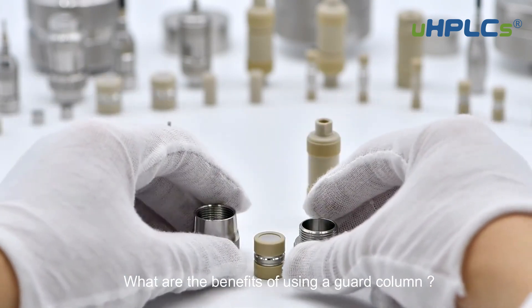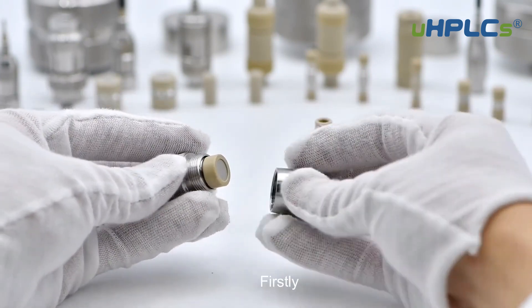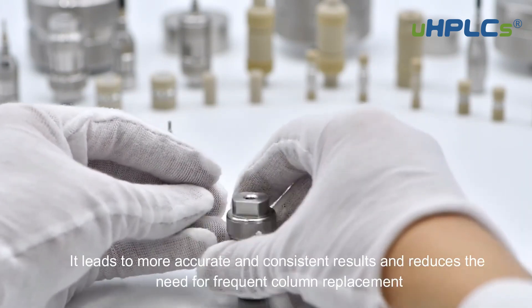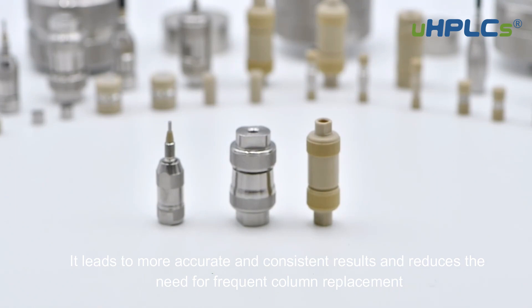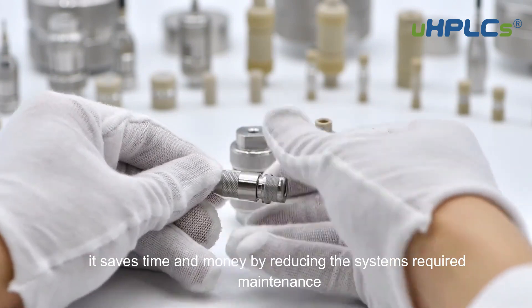What are the benefits of using a guard column? There are several benefits to using a guard column in your liquid chromatography system. Firstly, it improves the overall performance of the analytical column by reducing the number of contaminants that reach it. It leads to more accurate and consistent results and reduces the need for frequent column replacement. Secondly, it saves time and money by reducing the system's required maintenance.